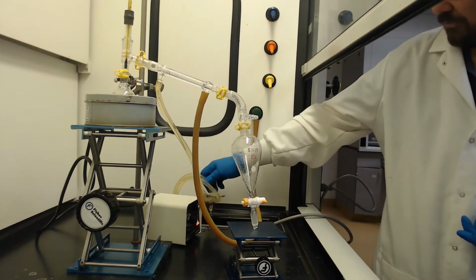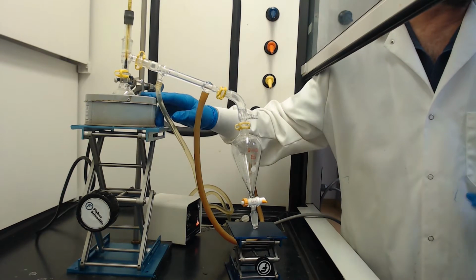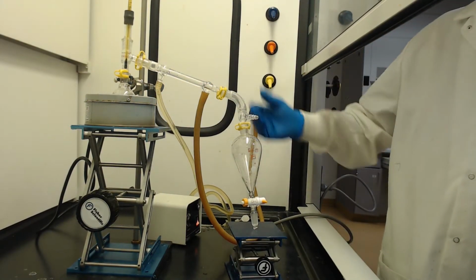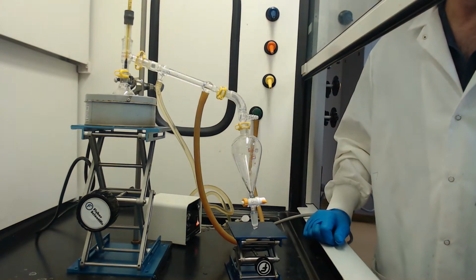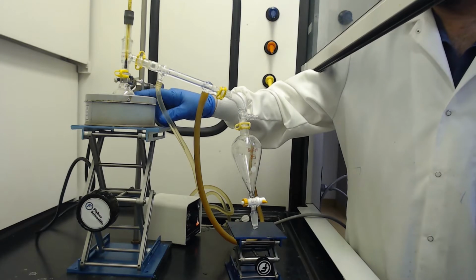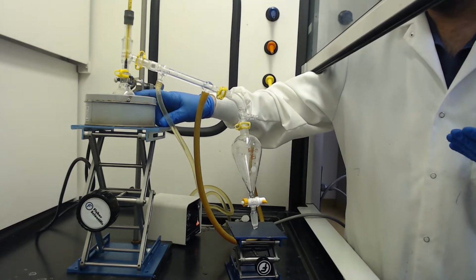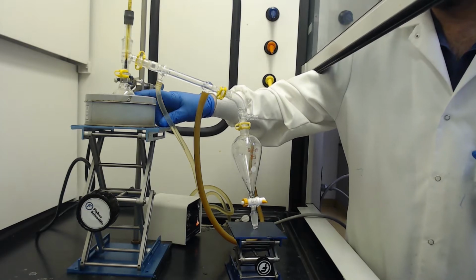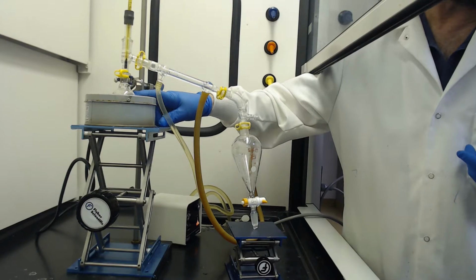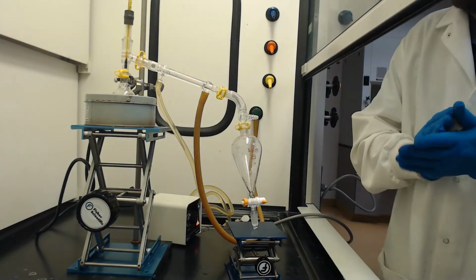I've got a nice water flow. We've got the heat going. It takes a little while. It's electric, so it's got to get the heat generating. And we'll distill over some product. We want to make sure we don't distill this to dryness. We'll start seeing a vapor forming, and that'll give us an indication that we should stop the reaction. You never want to heat something to dryness because you'll likely crack the flask and make a big mess, and then you've got to clean that up, and who wants to do that?